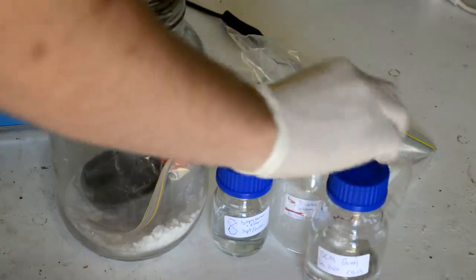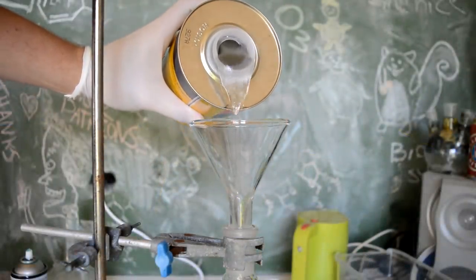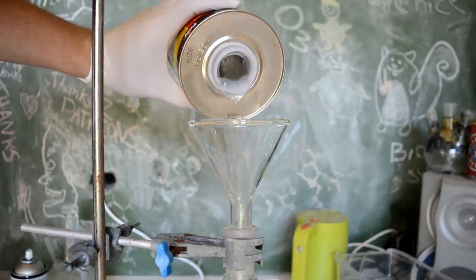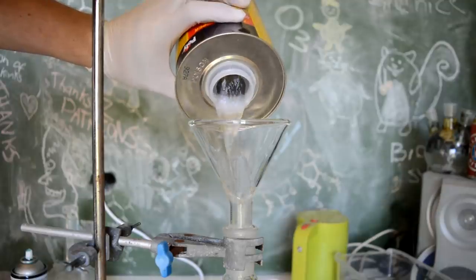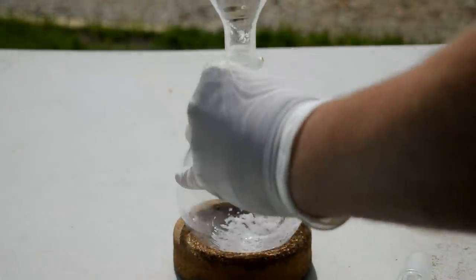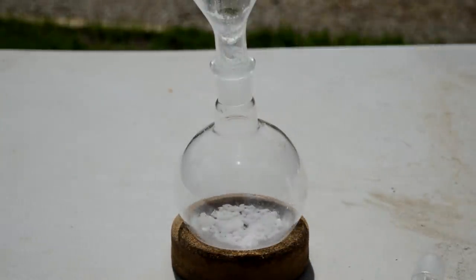This is my dichloromethane. This came from paint stripper from the same hardware store everything else is coming from. I distilled it from the paint stripper. It comes over with some methanol, but then I redistilled it and then distilled it over phosphorus pentoxide. Now, phosphorus pentoxide is a very good dehydrating agent. It's not something you find at your hardware store. It's not something you find very easily at all.